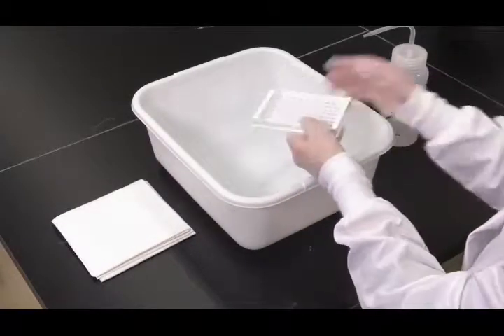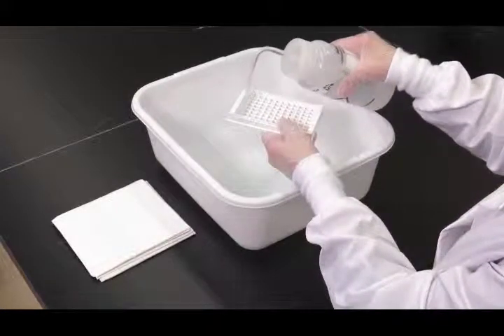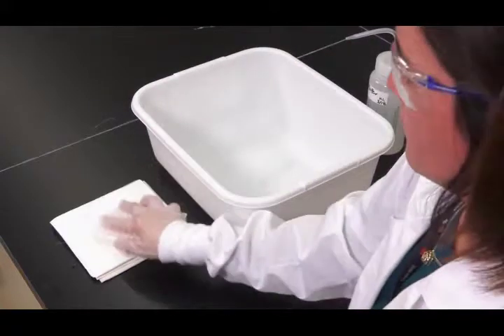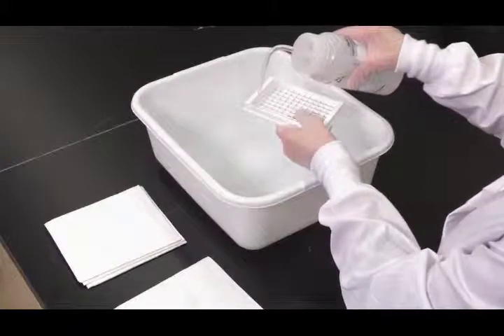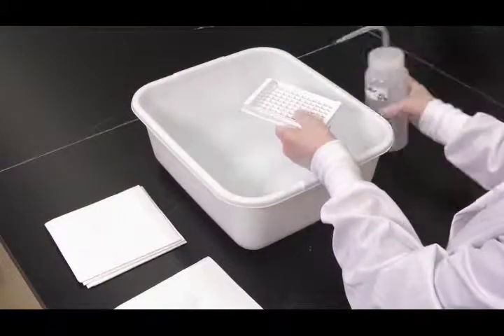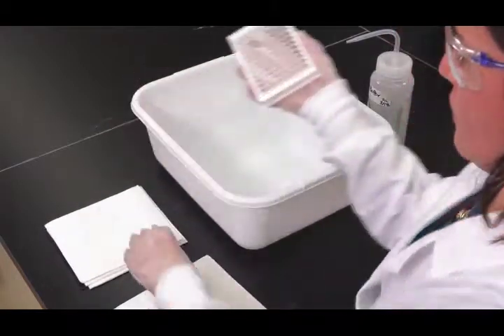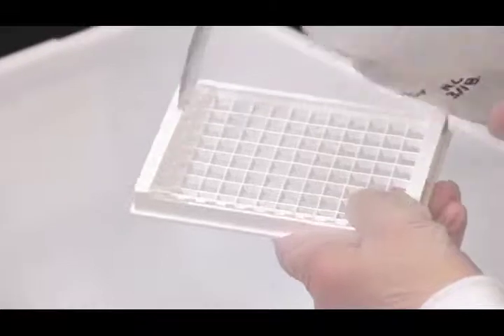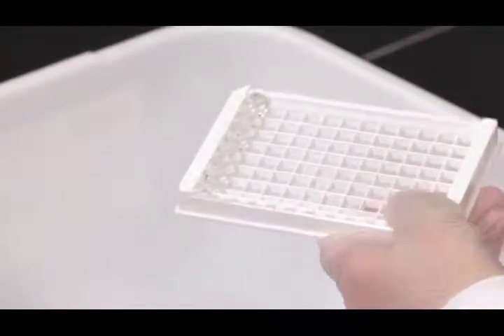After incubation, aspirate the contents of the 3M ELISA wells. Fill each well completely with 3M wash solution and aspirate. If the wash is done manually, invert the plate and pour or shake out the contents into a waste container, and strike the wells sharply on absorbent paper to remove residual wash solution. Repeat this step 4 times for a total of 4 washes.